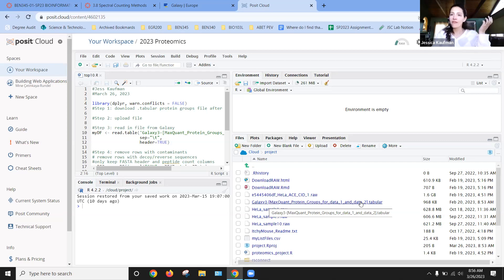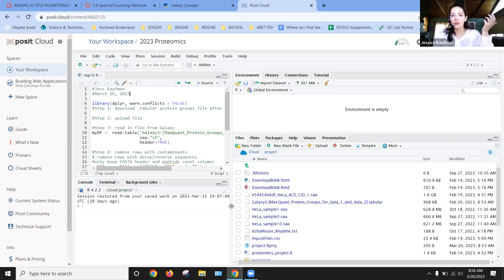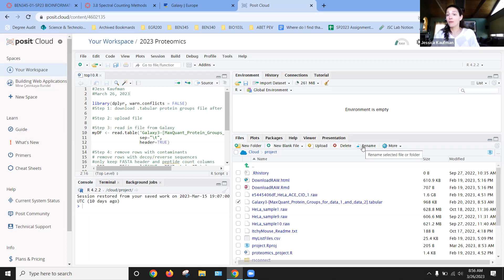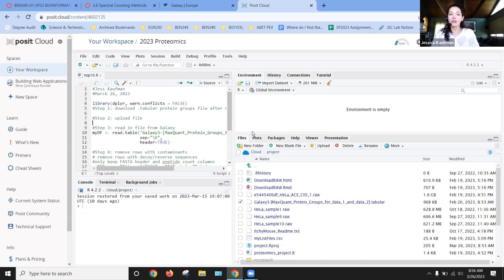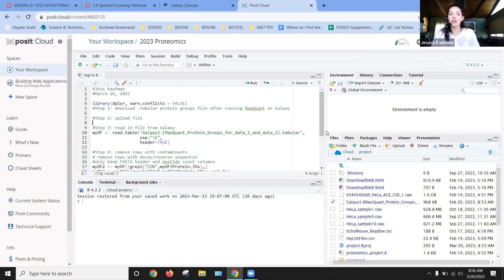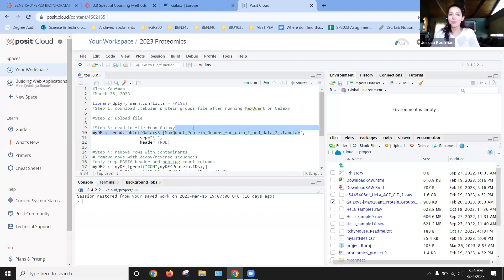With a file with a long name like this, we have two choices. We can either click the check box here and rename it to something simpler, like proteins.tabular, or we can be really careful when we're writing our script to not type the name and let R do it for us. So I'm just going to remind you guys how to do that.